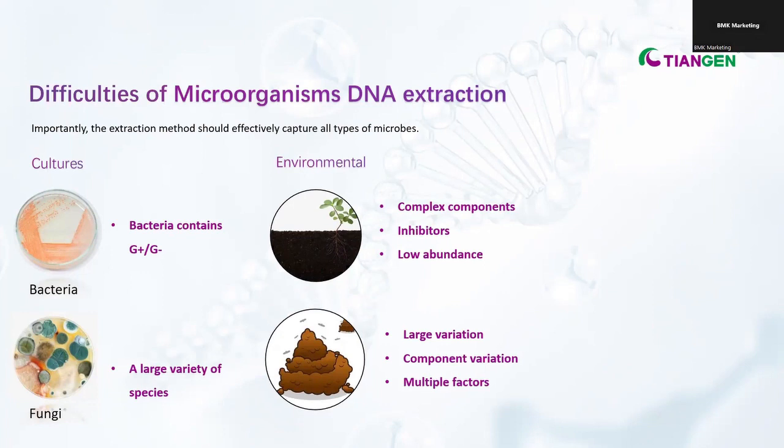For example, there are fresh feces, freeze-dried feces, and fecal water. Component variation is quite big. There are significant differences in stool composition due to the type of donor, health status, and dietary habits. And there are multiple factors that contribute to the wide variation in quality, consistency, and microbiome community composition of different stool samples.